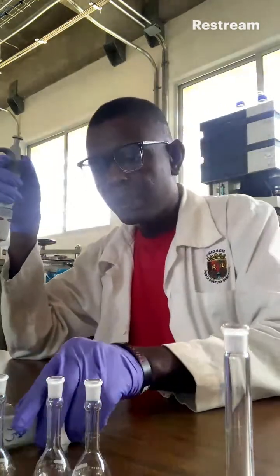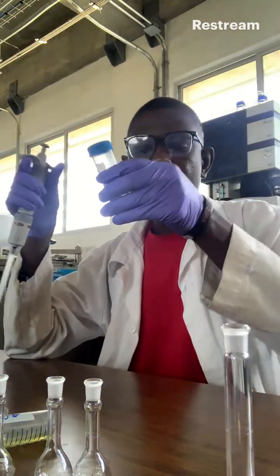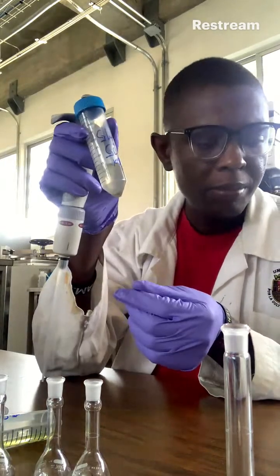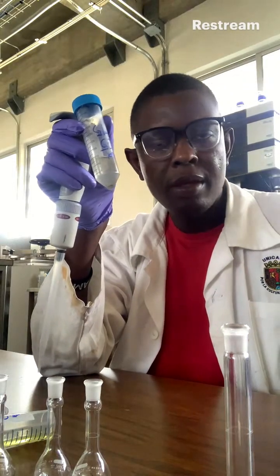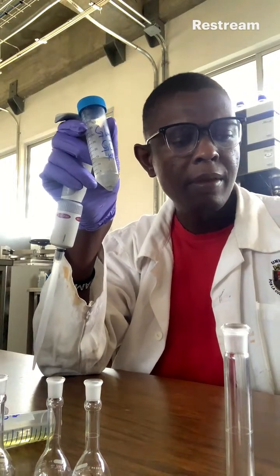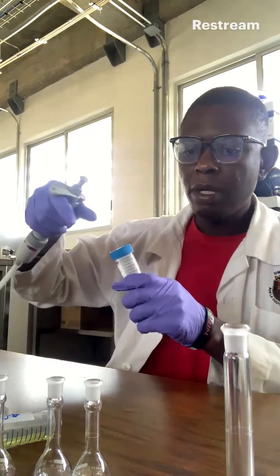So I'll be starting with the glycerol. Here's a sample I prepared, and this is glycerol carbonate. I will be taking out 5 ml of it.